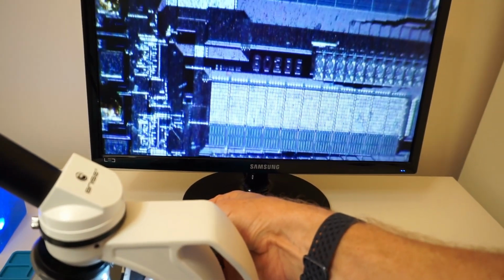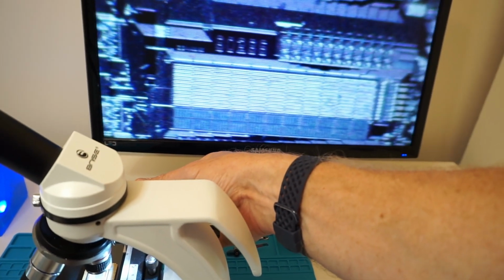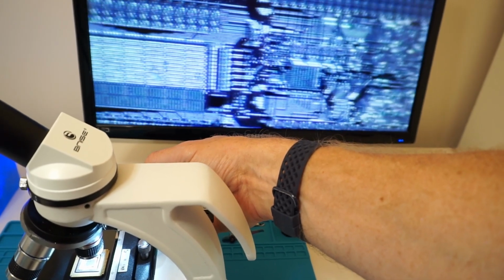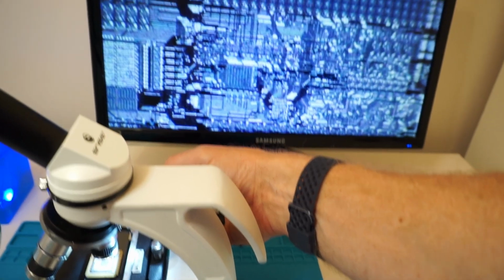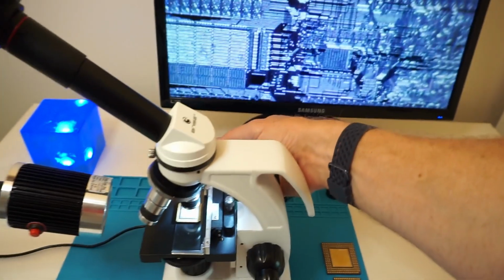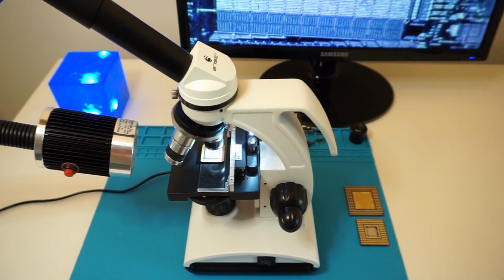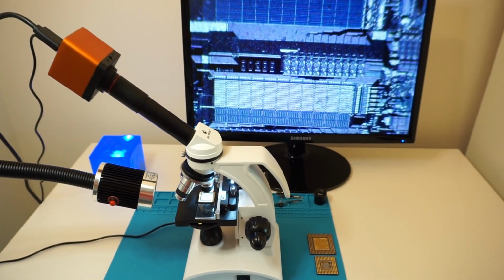There are also some other frame boundaries, like the maximum length of a CPU you can see, but actually I'm super happy with that because it gives a lot of stability to the system, and then using such a nice setup in total makes now a lot of sense.